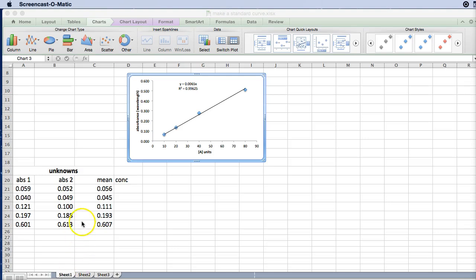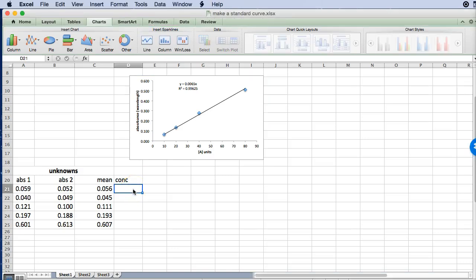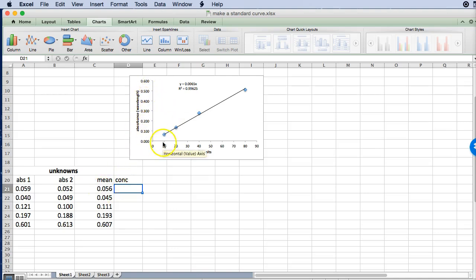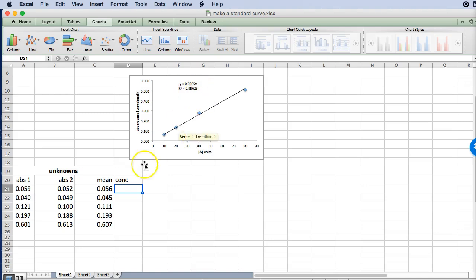So here are the absorbance values I got for my unknown samples. I've already calculated the mean and now I want to figure out the concentrations. So you have to think for a second before you do this. These are absorbance values so basically what I have here is this value from this side of the graph and I want to calculate the actual concentration which is on the x axis. So when I look at my equation I know the y, I need to figure out the x, so we just have to apply a little bit of algebra.